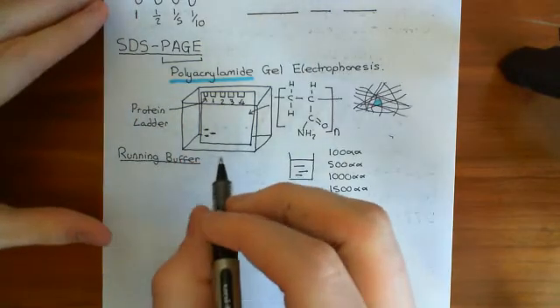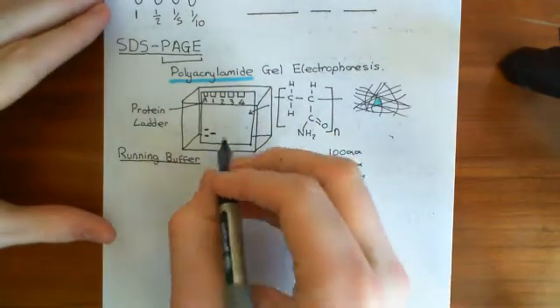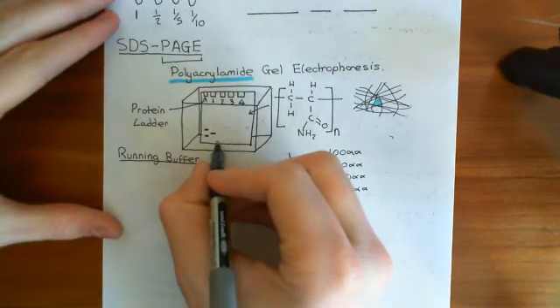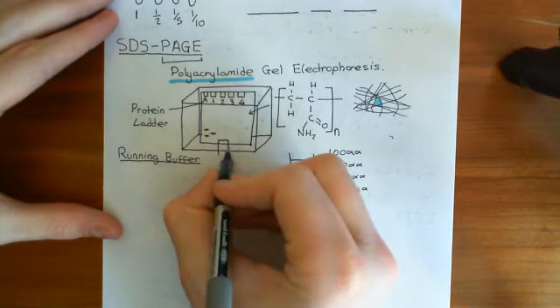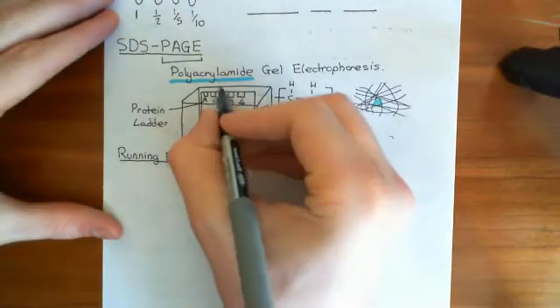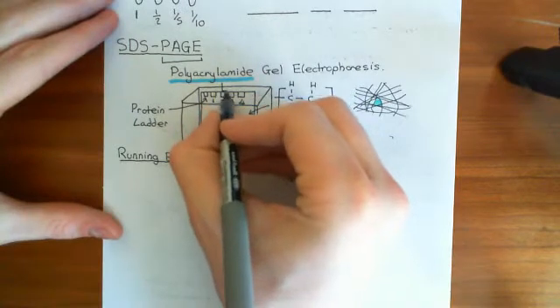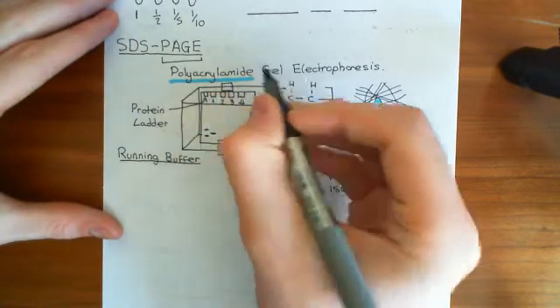So basically what you're going to do is - well, in principle this is what happens. When you actually look at the chamber, it doesn't look anything like this. But in principle, what you're going to do is put two metal plates, like so.